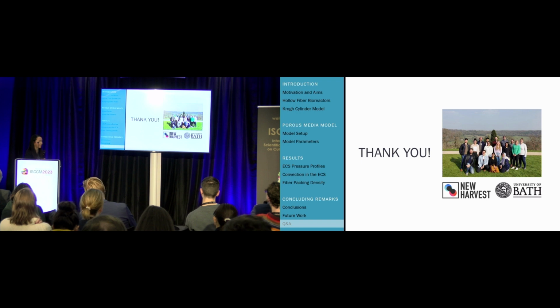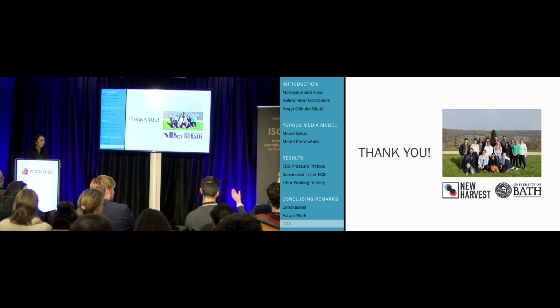Yeah, so I would say that this model mainly just wanted to highlight that Krogh cylinder modeling is very well equipped to answer that kind of question, and that the cell layer thickness is something that can be looked at from a Krogh cylinder standpoint. And so this model is just highlighting that when you're looking at the Krogh cylinder, you shouldn't take credit for convective mass transport benefits. If you're using carriers, it's operating under basic assumptions of oxygen solubility in media. But if you increase that, then it could go further, maybe. So you could have a higher cell layer thickness if you had that.